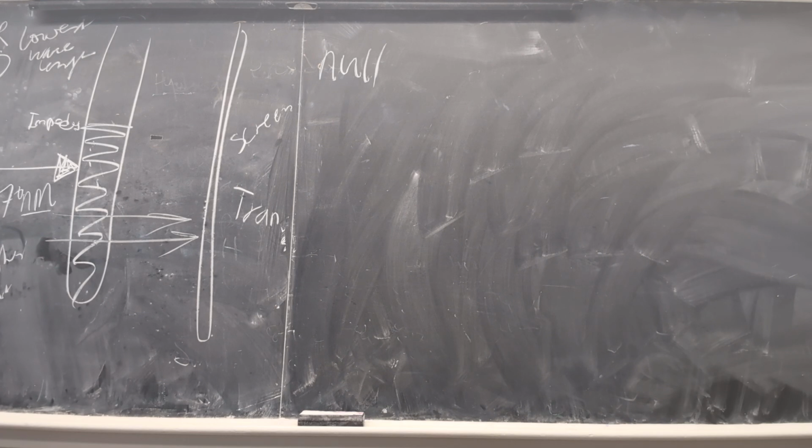We're putting the pH 9 liquid in the pH 9 vial. 8.5, put it into the respective one, because we gotta have the same amount of pH 9. Put your pH first on each one. But do not use the same one, right? That's what I'm telling you. Don't use a different pipette, now use a dropper. For the rest, just use the dropper. Use the pipette for one of them and then use the dropper for the rest.